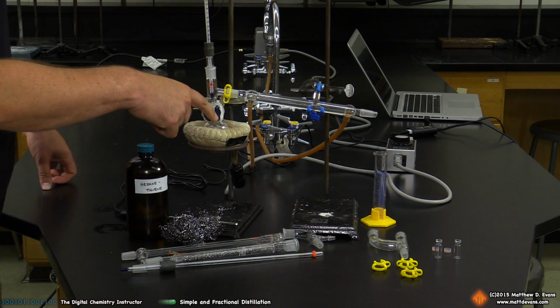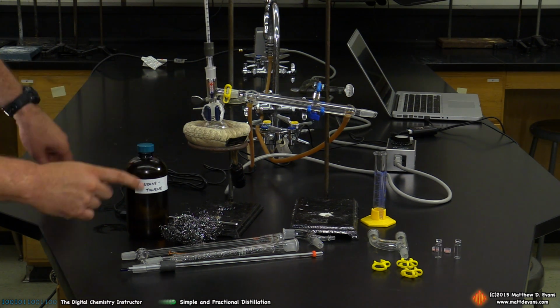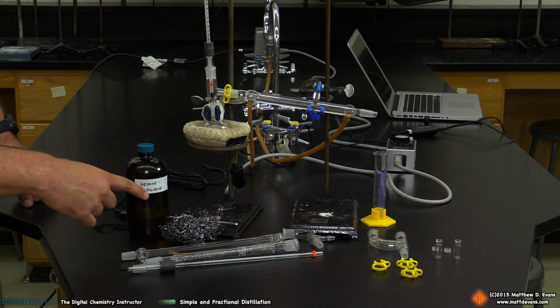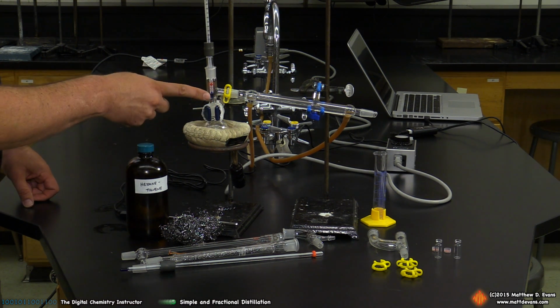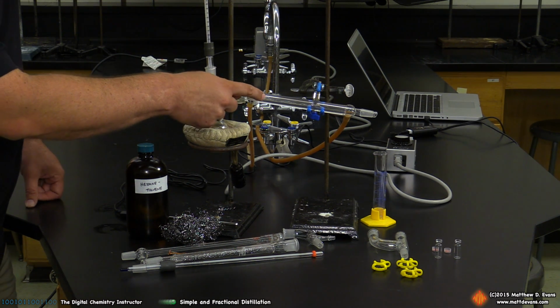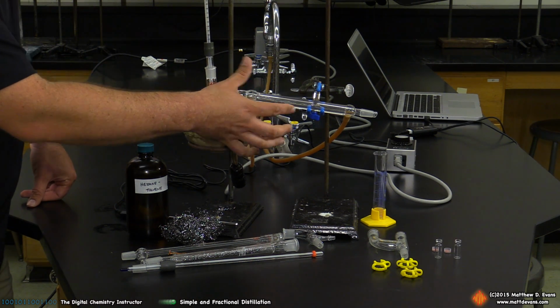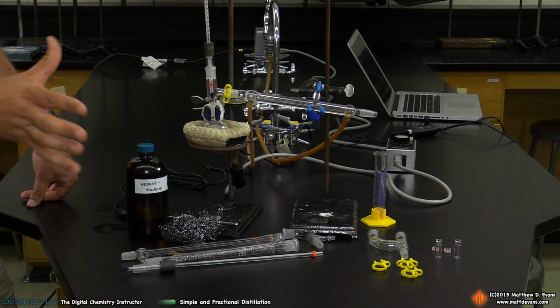Now here's how this works. As we start to heat this mixture, the volatile components, so the lower boiling point compound, which is hexane in this case, is going to boil a little bit sooner than the toluene. As the hexane vapors travel up this setup, they're going to reach this point right here. Our thermometer is going to register the temperature, which we want, and they're going to start to travel down the condenser. The condenser is a really fancy piece of glassware. It's got two chambers. It's got an outer chamber which the water passes through, and an inner chamber which the gases pass through.